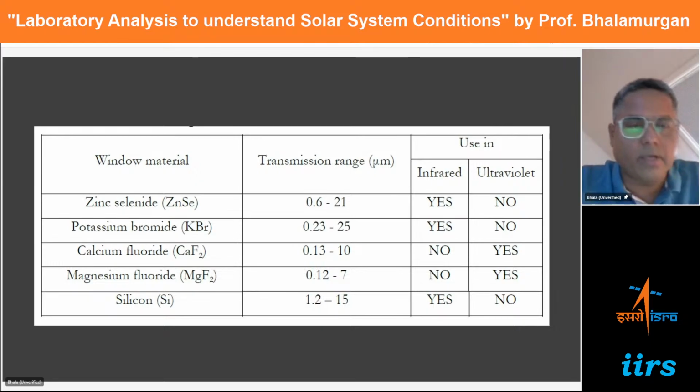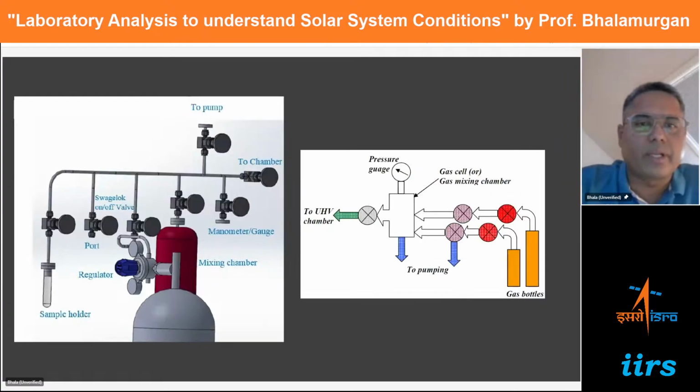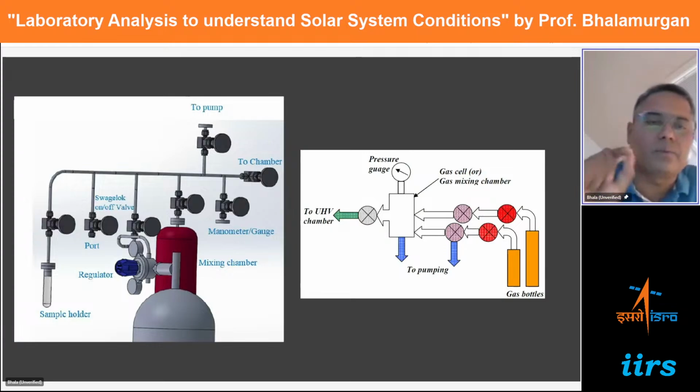Yes. Okay. So the substrate, what you see there, these are made of different materials: zinc selenide, potassium bromide, calcium fluoride, magnesium fluoride, lithium fluoride, and so on. The reason is some of them are infrared transparent, some of them are UV transparent, or vacuum ultraviolet transparent.